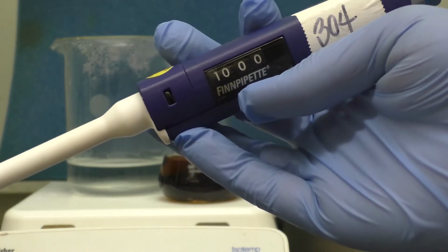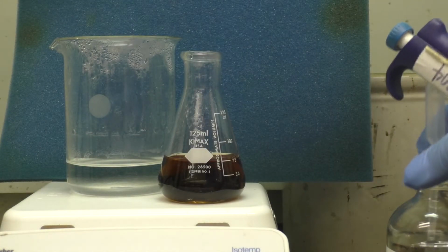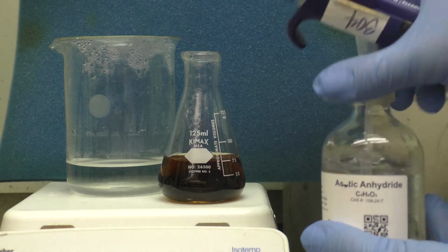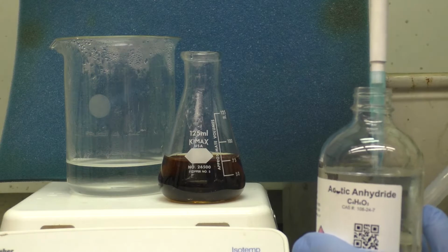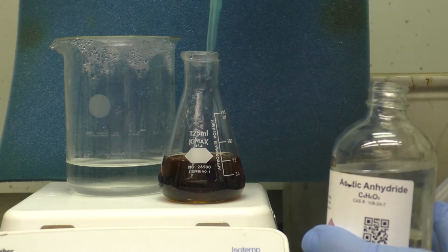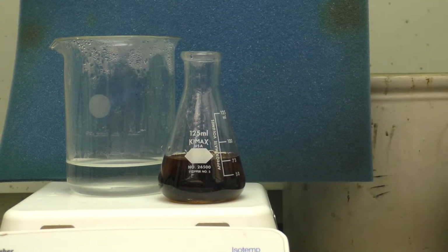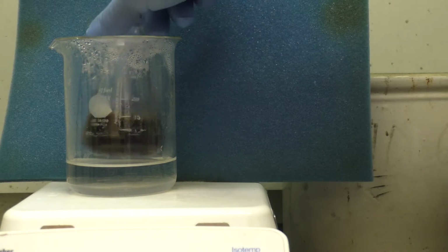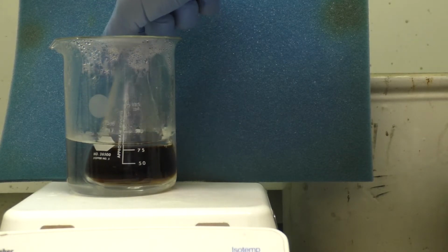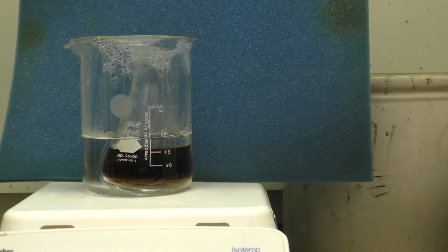We'll do this using 2 deliveries of a micropipette. Now that I've added the acetic anhydride, swirl this up some, place this back in the warm water bath, and let this react for approximately 15 minutes.